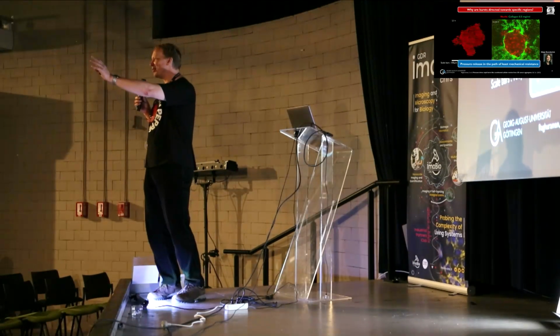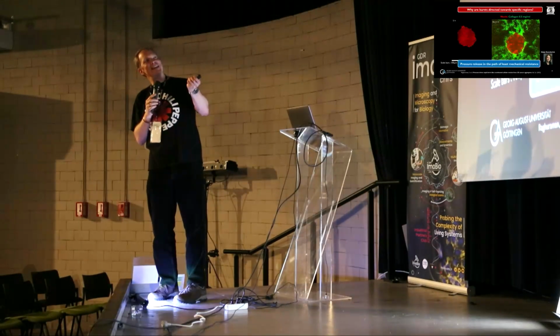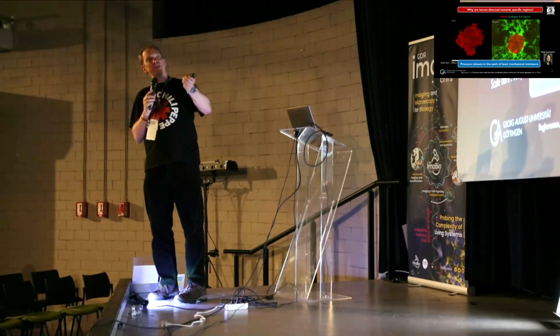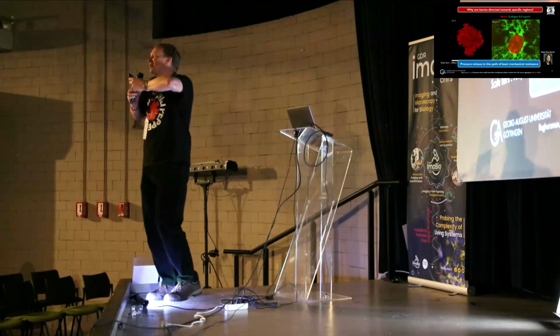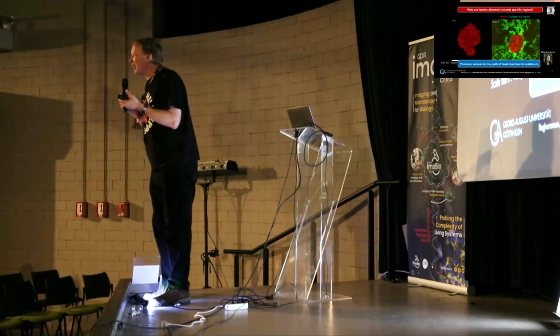Oh, yes. You're absolutely 100% right. I just kicked this out because I knew I'm over time. We were very excited because we thought we could learn something about the cells, their weak points and all of this. But when we carefully looked at it, there are some void regions because the gel is so thin, and they just expand in these. So in the end it's less exciting, to be honest.